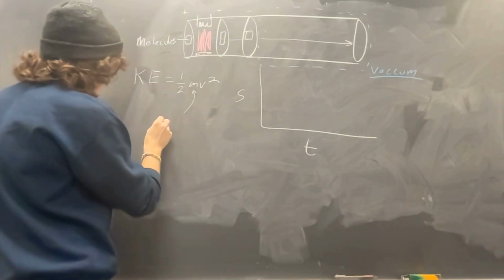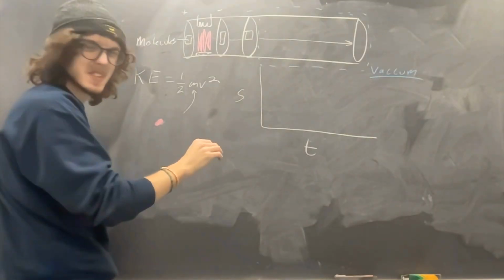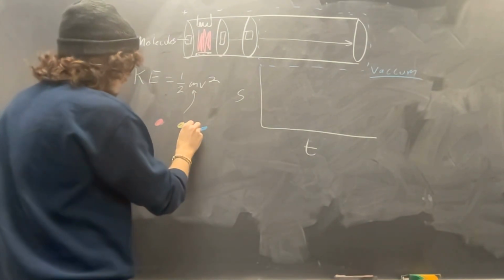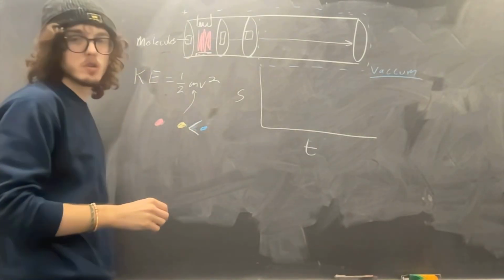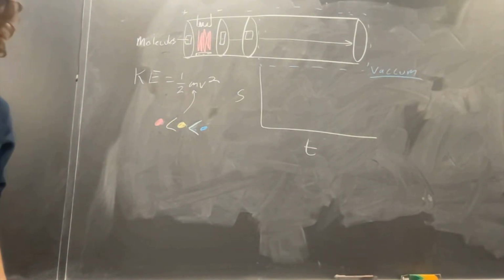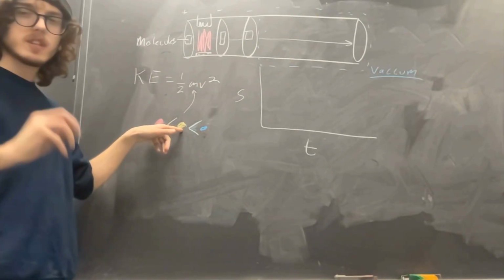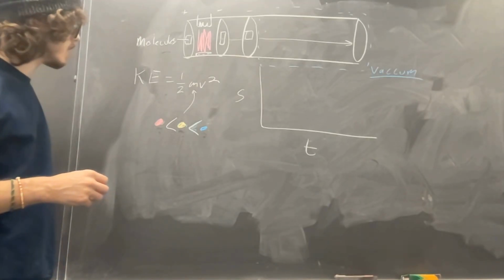Let's define three masses that are going to go through the time-of-flight. I keep saying MALDI, I should not say that. We have this red particle, we have this yellow particle, and we have this blue. The blue is the most massive particle, where red is the smallest and yellow is in between. So a really heavy fragment or ion, a relatively intermediate one, and then a very small ion going through that mass spec being accelerated.